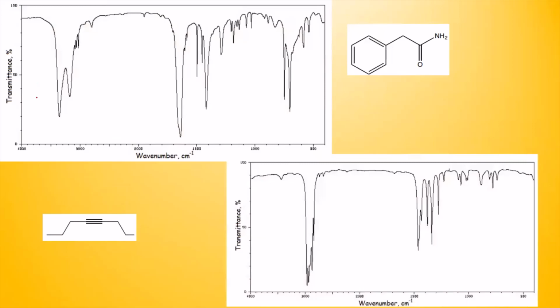This again, this tooth-like looking thing. Again, I keep saying that. The C triple bond C. Now, if you see that this tooth-like looking thing is not before 3000, it's actually after 3000, right? So it could be this. If you see C triple bonds, the CH stretch is around 3300, which is what this is, right?